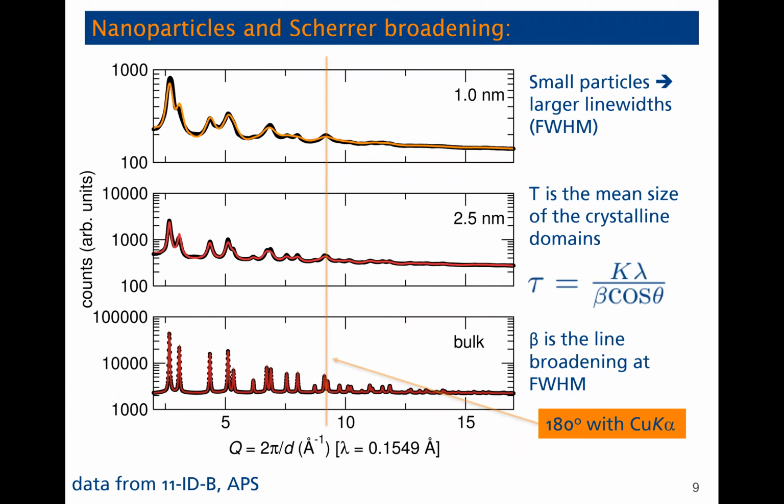So far, we've talked about the main thing that we can get from X-ray diffraction, the different crystal structure phases. We can also get some information from the more diffuse elements of the diffraction pattern, which I talked about, mostly related to different defects in the crystal structure.